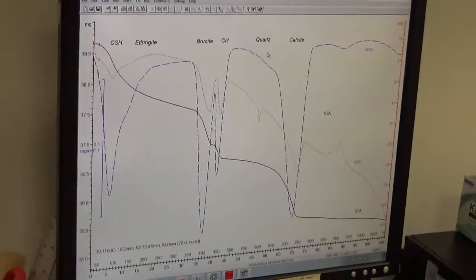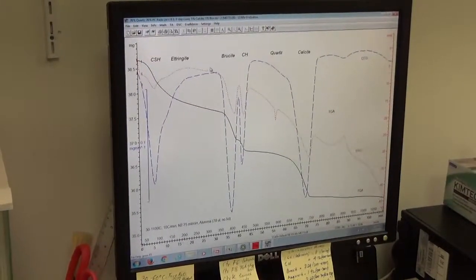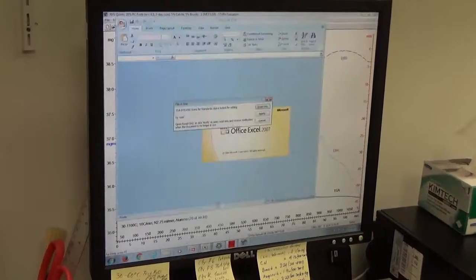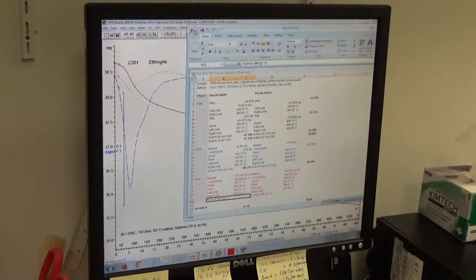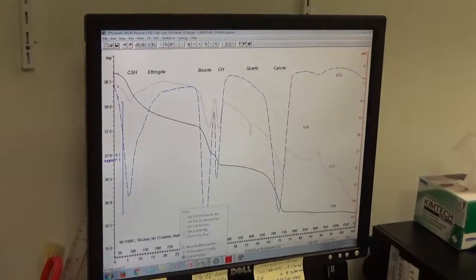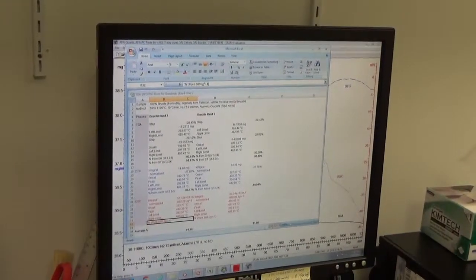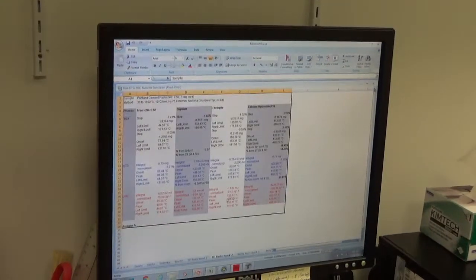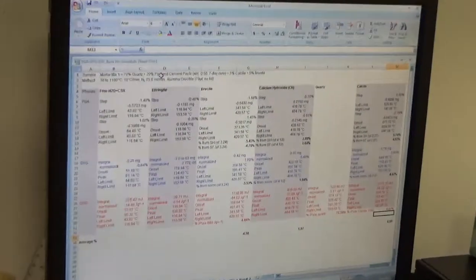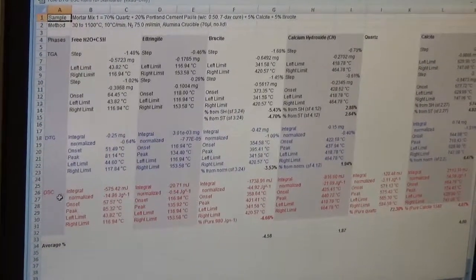To show the quantitative determination: usually I don't put the data on the plot — to avoid cluttering, we keep the plot like that. Then I go to Excel. For example, the particular sample I ran shows 70% quartz, 20% Portland cement paste, 5% calcite, 5% brucite. Here I am showing you the TGA data, DTG data in blue, and DSC data in red.